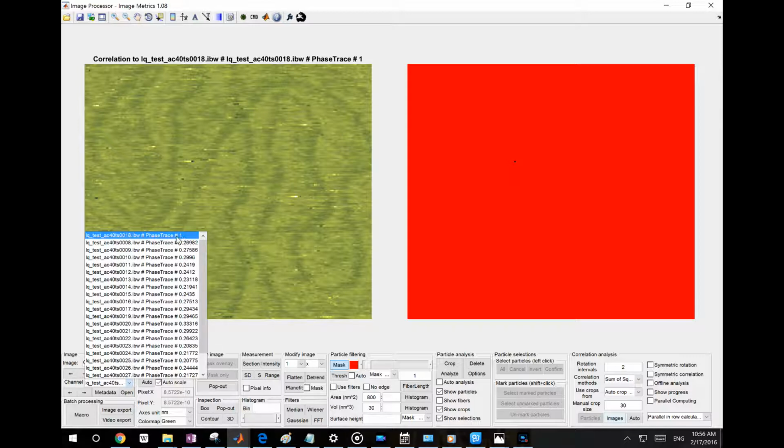And there's a third part which gives you the correlation coefficient. As you see here, that 1 means that it's perfectly matched. It's not surprising because that's the template that we use. It definitely matches up perfectly with itself, so that's 1. But when you try to use number 18 as the template to match other images, now you get a small correlation coefficient, about 0.2 to 0.3.